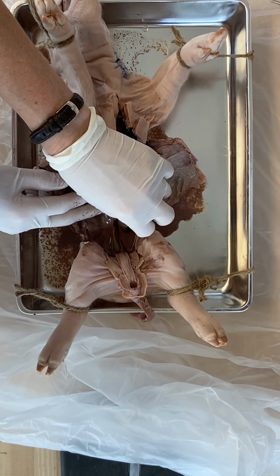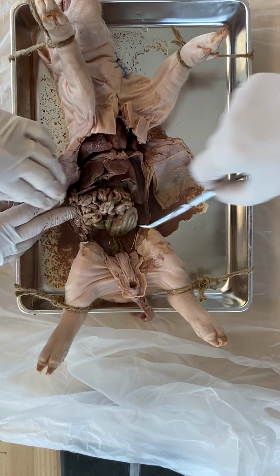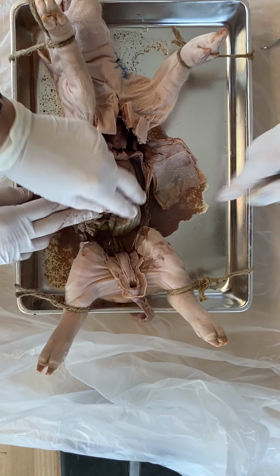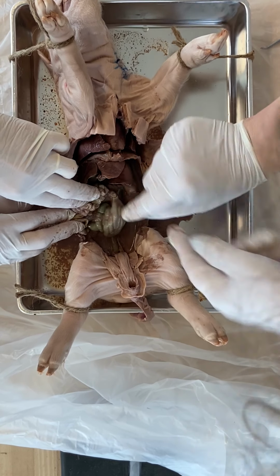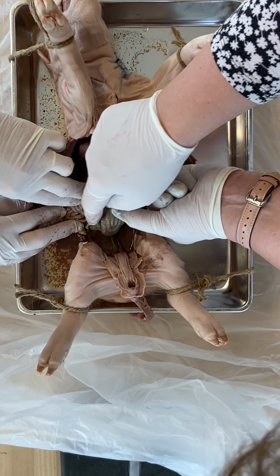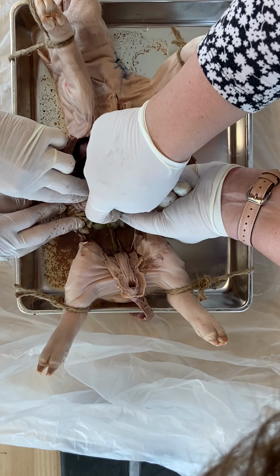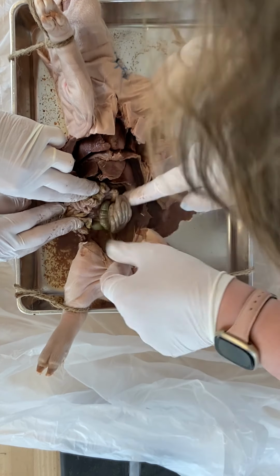Pig large intestines are a little different in configuration to ours. Ours goes just round in that square, and you can see the pig one is quite different. Again, on a membrane, it's very organized, with membranes holding it all together. In fact, I think it's broken one, I can just feel it go. Large intestine, so it would almost seem like this.